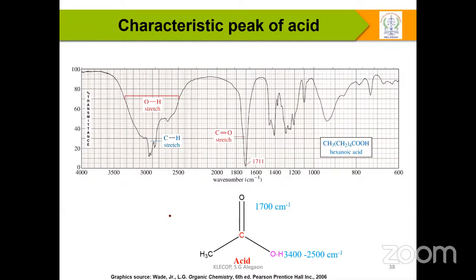But one very important thing to understand is that the CH stretches of CH3 or CH2, symmetric and asymmetric, are merged with the carboxylic acid band. Even so, sometimes under standard conditions, as the author has published, the CH stretch shows a strong peak overlapping with the OH stretch. And the C double bond O stretch we observe at around 1700 reciprocal centimeter.